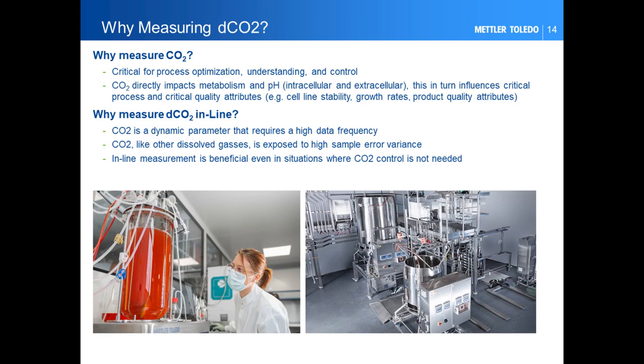So dissolved CO2 is a very dynamic parameter simply because the dissolution rate of CO2 is about 25 times higher than oxygen in water at 37 degrees, and it's faster at lower temperature and higher pressure. And dissolved CO2 will impact growth rate, quality attributes of the protein, or the purity of an antibody targeted.